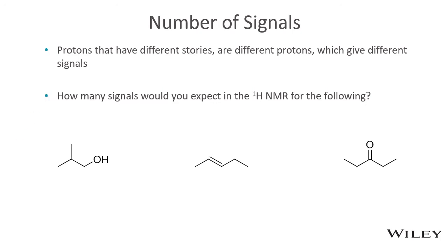So first thing I like to do is draw on the hydrogens that we cannot see in the bond line structure. Now we have a hydrogen bound to the oxygen here that we can see, but we have two on this carbon here, 1, 3 on this end, and another 3. Now, the hydrogen that is bound to the oxygen is obviously its own type. There's no other hydrogen in this molecule that is directly bound to an oxygen. So we'll go ahead and call this one type A.